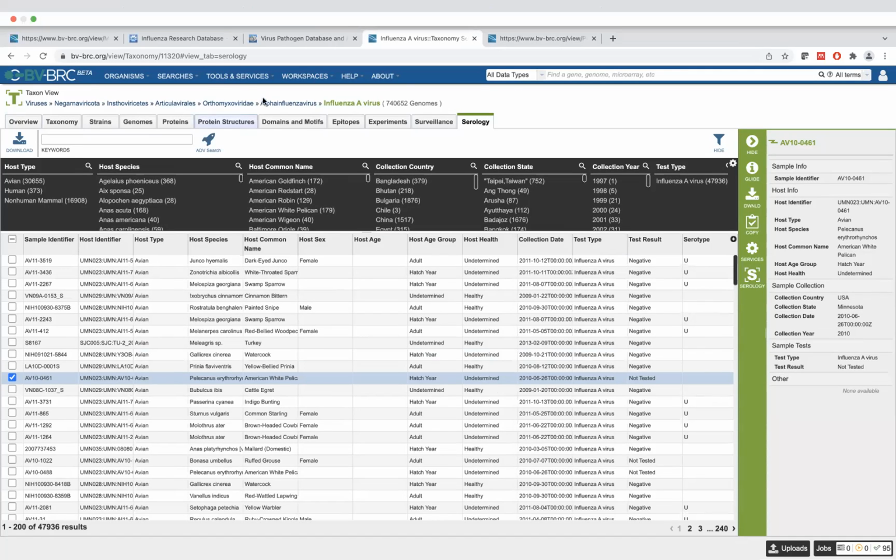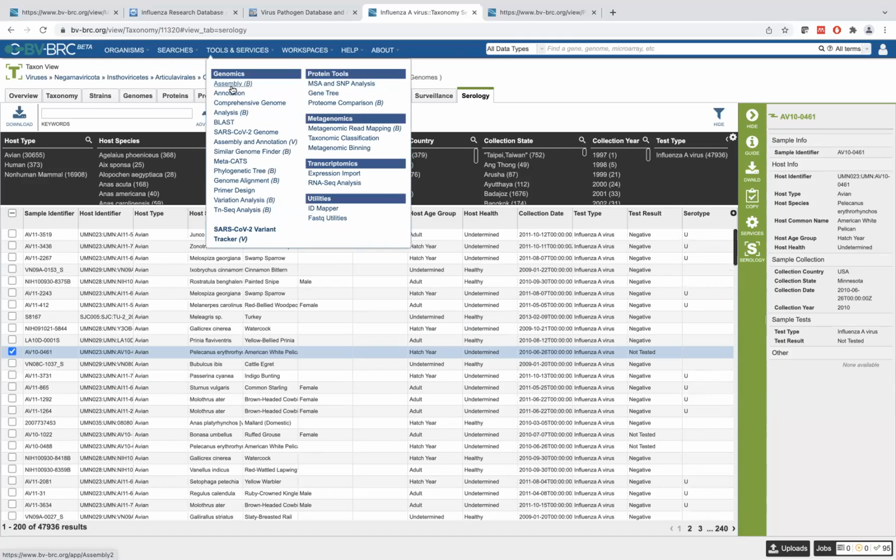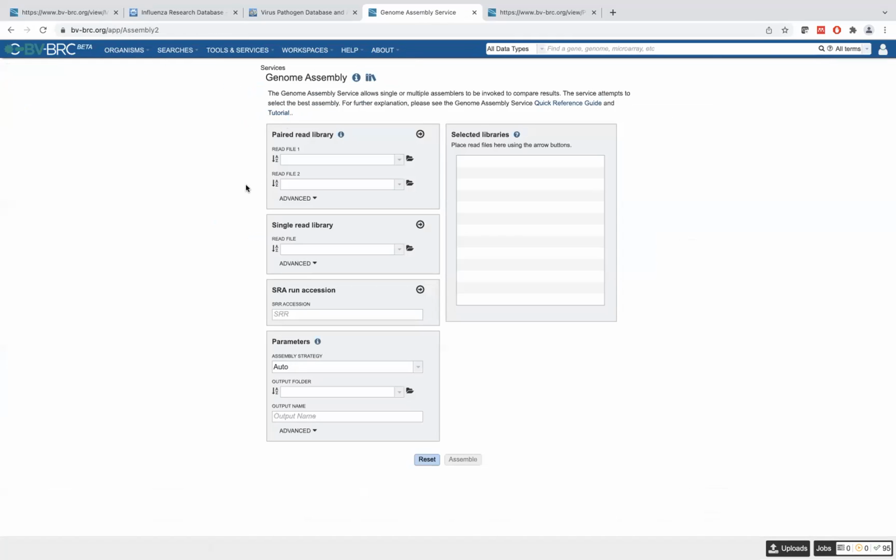He's watching, but I'm not sure if he'll be able to answer. We'll get back to you on that one. What was the question? Whether de novo based assembly can do long and short reads. I think it can do both. Yes, it can do both. We have a couple of different assembly strategies that can address both long and short reads.